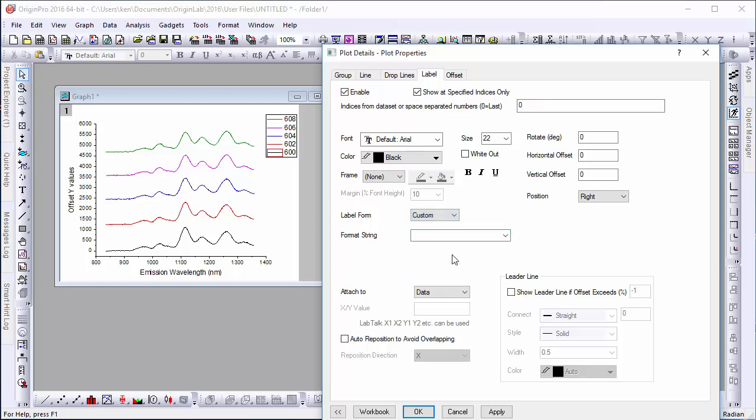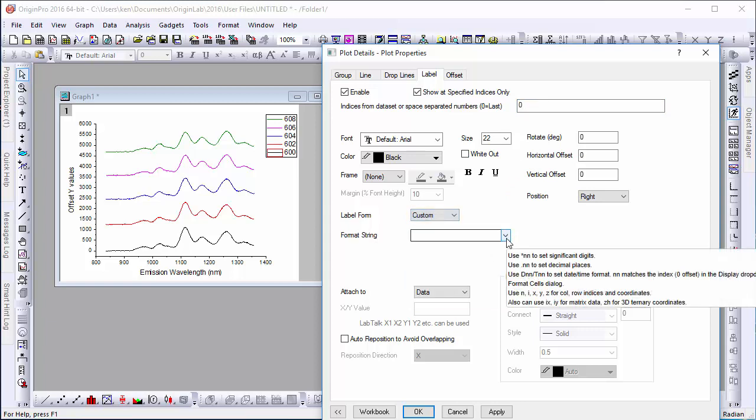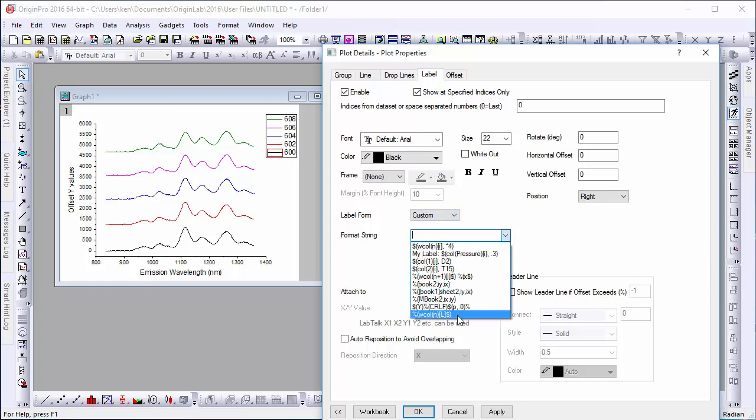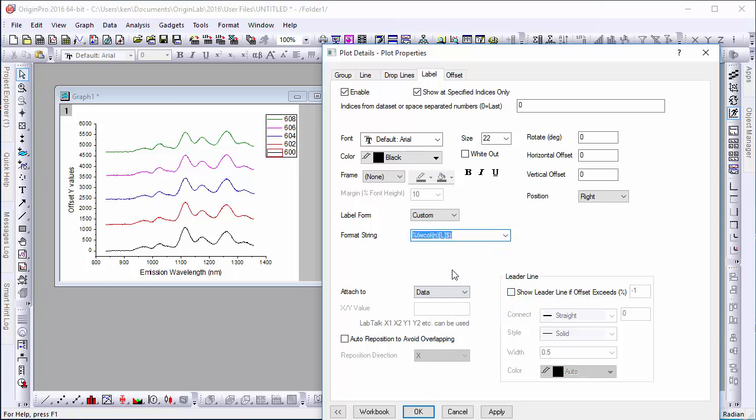To change this, set the label to Custom. Then, in Format String, select the last option which should read roughly as %wcolnl, which returns the column's long name.